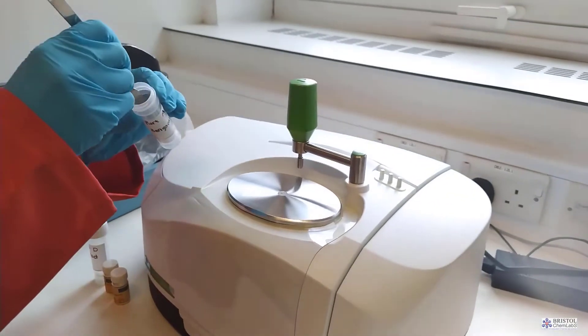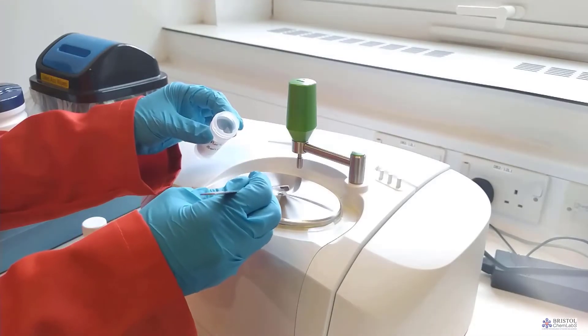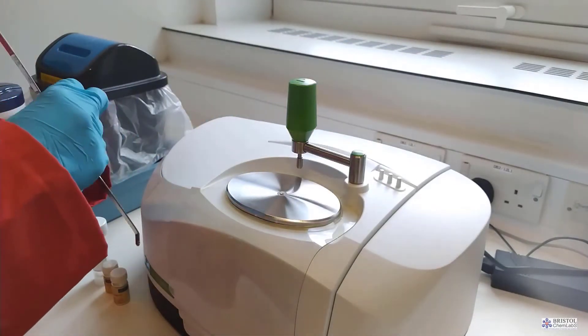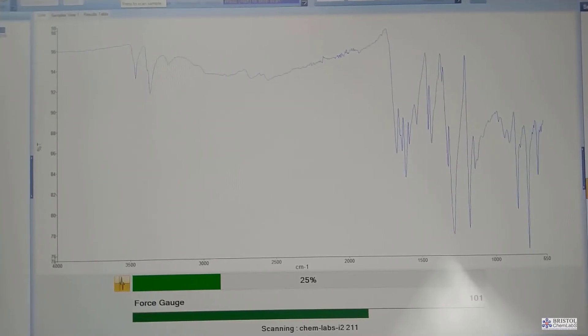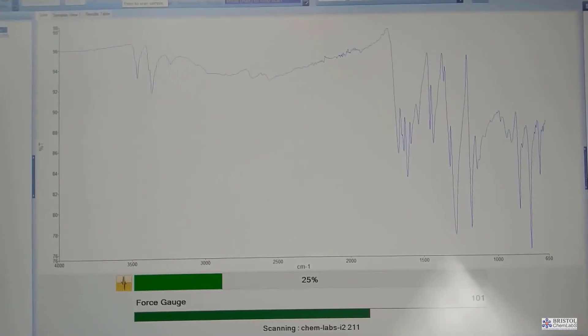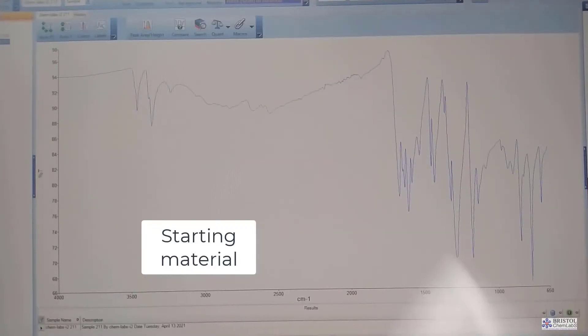To use an infrared spectrometer the first thing we need to do is to clean the diamond that is used as the window into the machine and we can use effectively a baby wet wipe for this. We can use propan-2-ol. We then let the diamond dry off which is very quick as propan-2-ol is very volatile. We also clean the mirror that is used to reflect the radiation back through the sample.